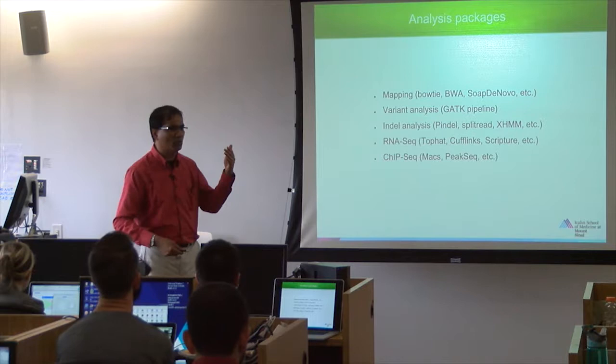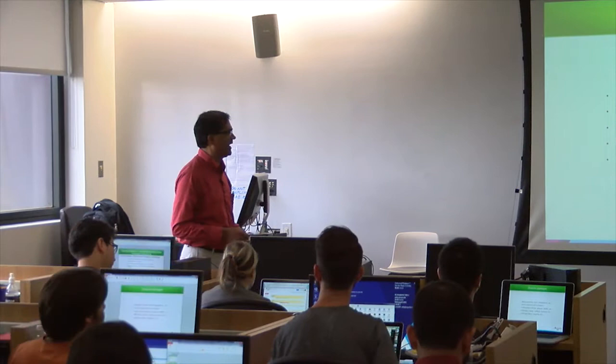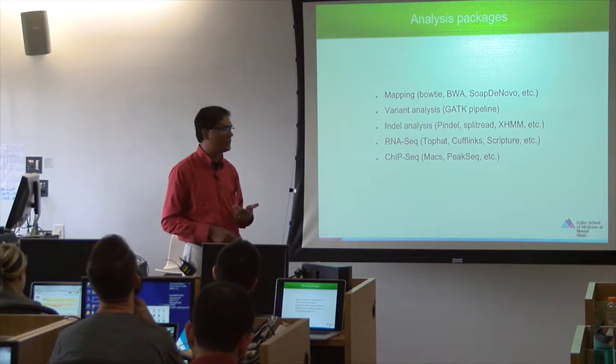And then more and more tools will develop, more specific. Specifically, can you identify all the variants? Can you identify all? So what I was telling was, I gave examples of different types of sequencing and analysis of the data from those different sequencing types, right? You can develop more and more improvements, faster, and get more accurate information from these. That's how you will get more and more.